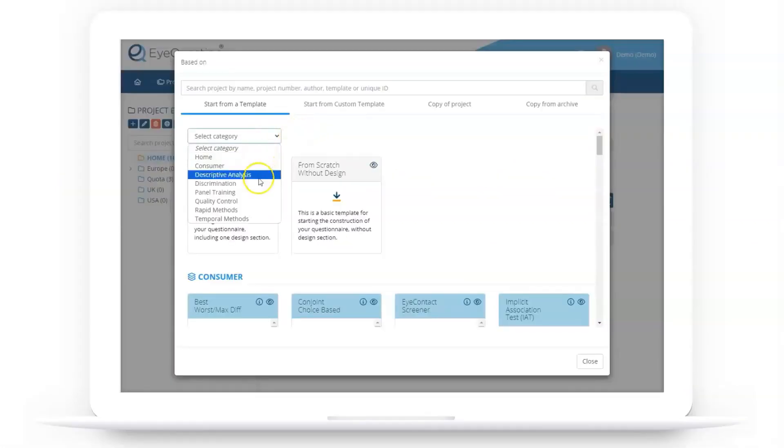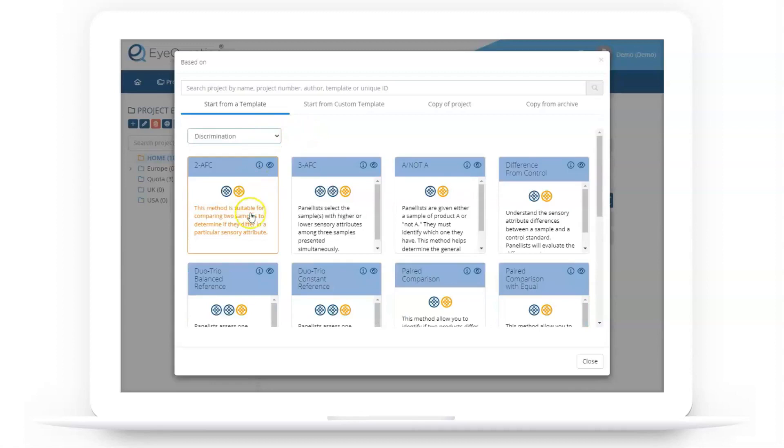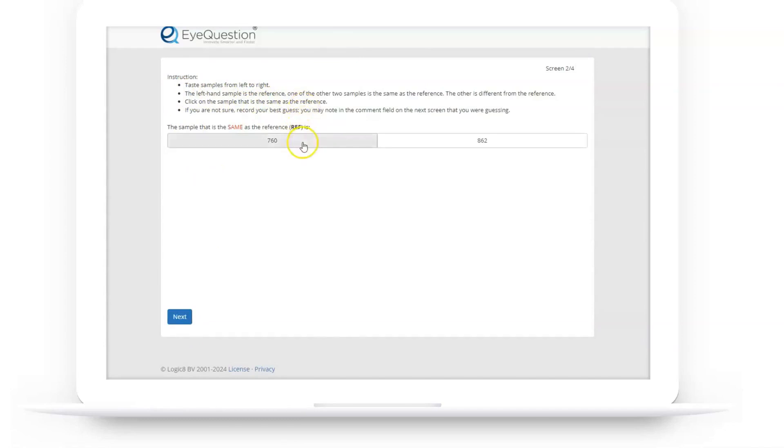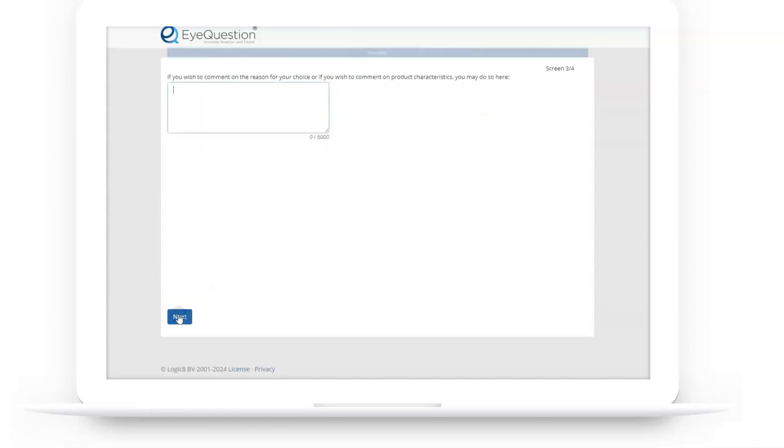In iQuestion, you can effortlessly select a pre-configured Duo Trio questionnaire using one of the templates provided. The questionnaire comes complete with instructions and the correct question for panelists to identify the sample similar to the reference.